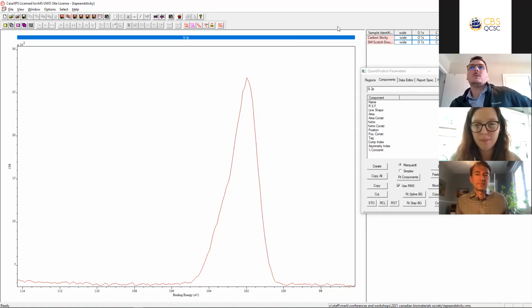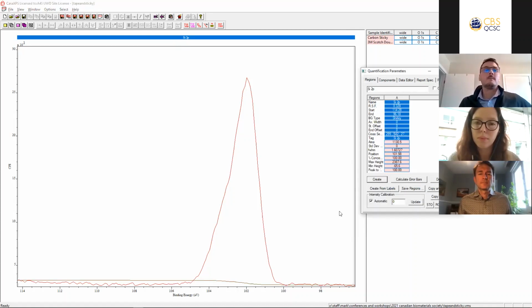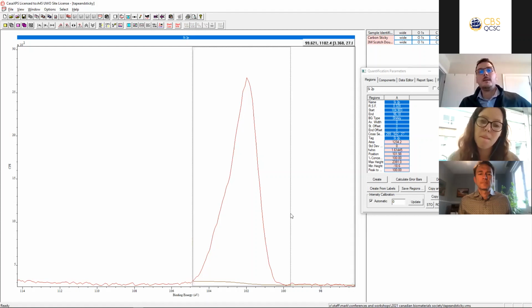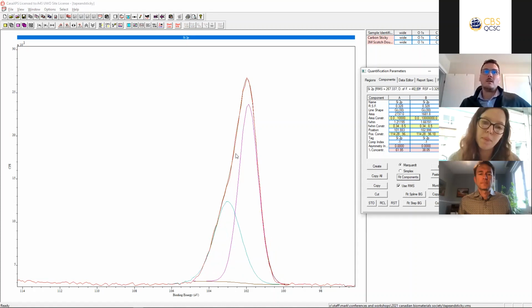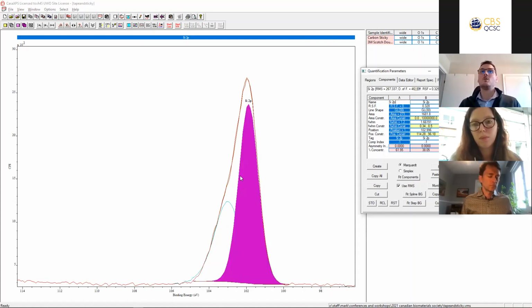So that gets back to it helps if you understand the chemistry of your system. So if I look at this silicon peak, from experience, I know a couple of things. First of all, the silicon 2p is a doublet, so I've got to put a doublet in. If I add a background and a doublet of peaks and fit it, it kind of looks right, but that may not be the correct doublet. So I have to understand from reference spectra and references what this doublet looks like, to tell me whether I have one species here or multiple species.